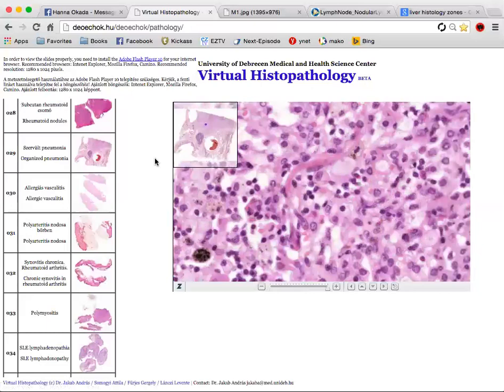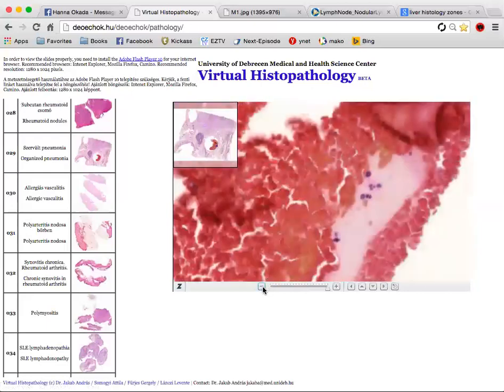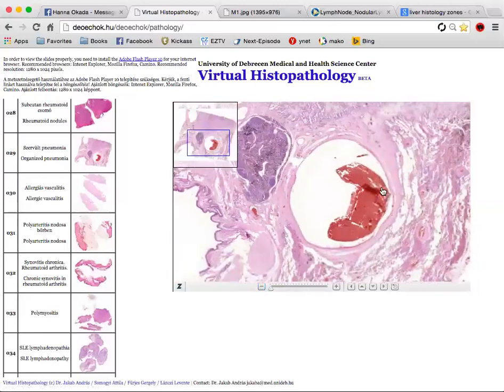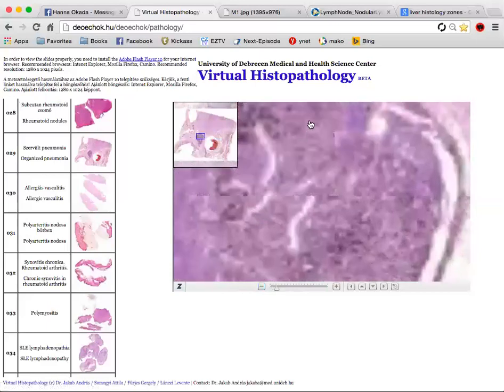Okay. So what's the red one? The red things, if you zoom out? Like here? Yeah, that's blood. That's a big blood vessel. Okay, what's this dark area? That's again dust.